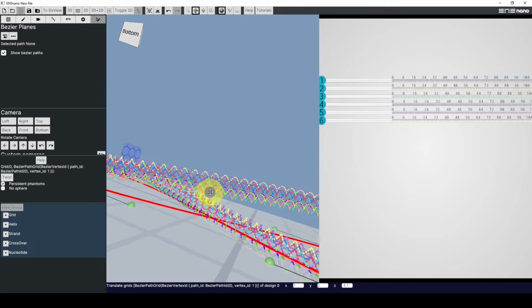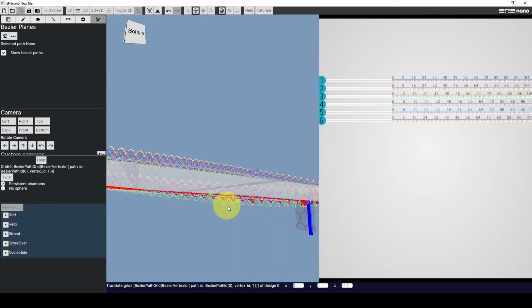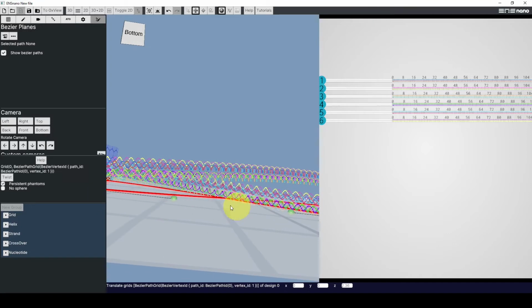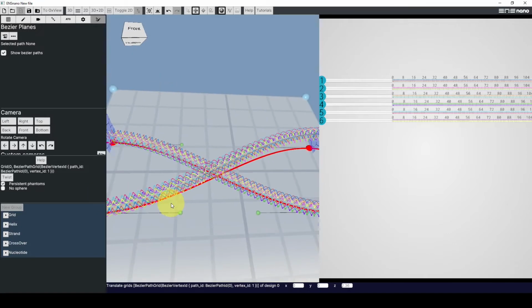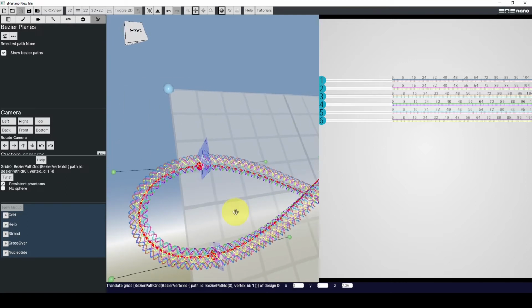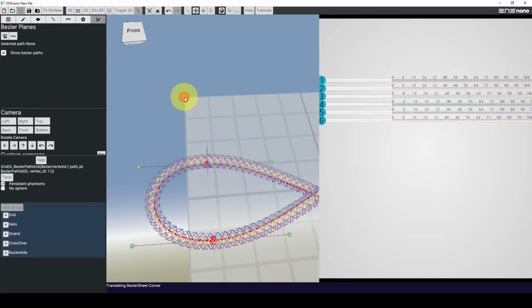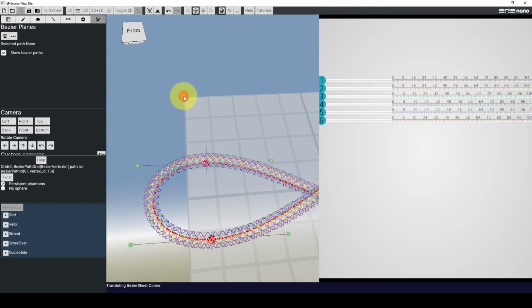Here it seems that it's about correct. I can adjust so that they touch. So this is approximately the correct size. And I can adjust the length of the curve again, because due to the modification, the shape is now a bit longer.